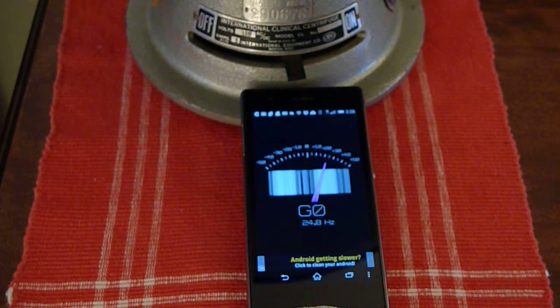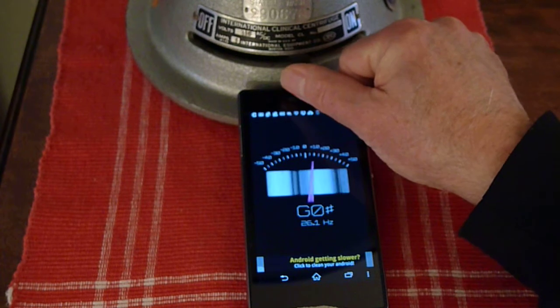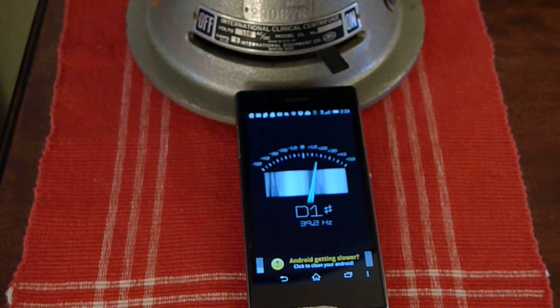You've got to get the right position. This doesn't work with every cell phone, by the way. In fact, it doesn't even work with this cell phone every time. It works pretty good though. Now let's crank her up. Can you see that? 40 Hz.